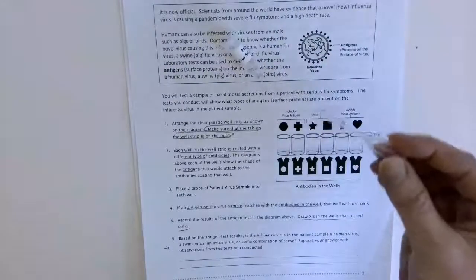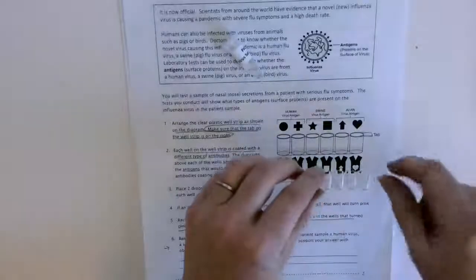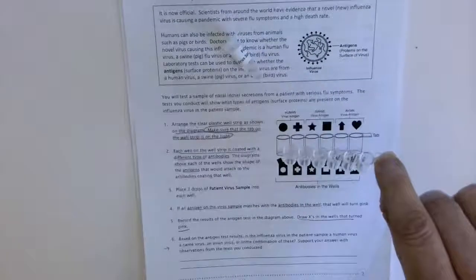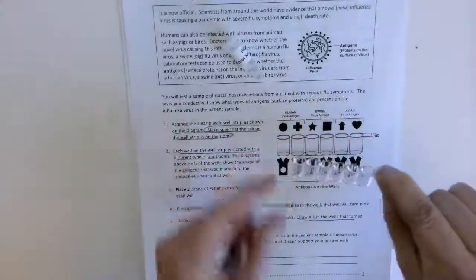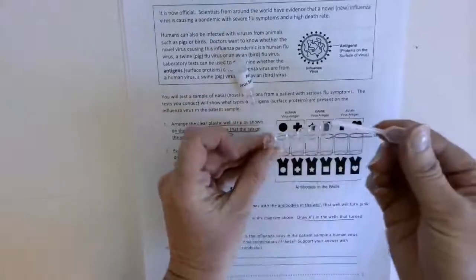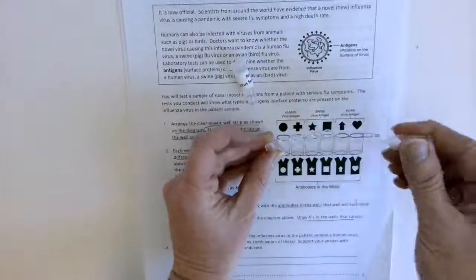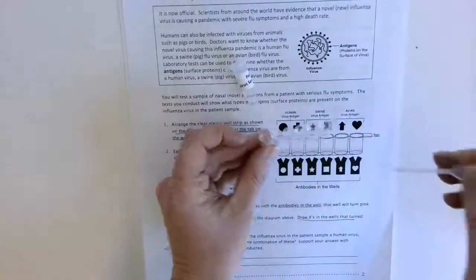Remember, you should try to never touch the pipette to the sides of anything. You're going to line up your well just like it says here with the tab over to this right side. It's very clear in the directions with that. The tab where you can hold on to it here is on the right hand side. That's critical because all of these wells have different chemicals inside of them that will change different colors when you add in this patient sample. Again, because this pipette is going to be used for the patient sample, you don't want to touch it to the insides of the sample because then you can cross-contaminate chemicals. So what you'll want to do is drop from up above so you don't cross-contaminate.